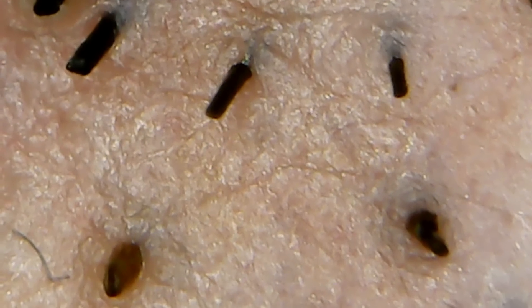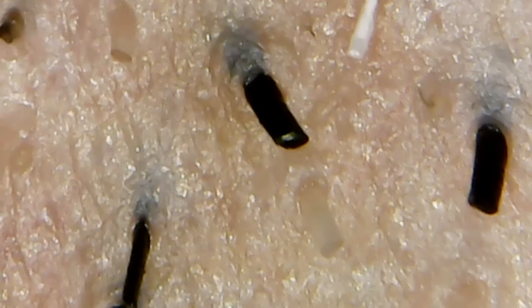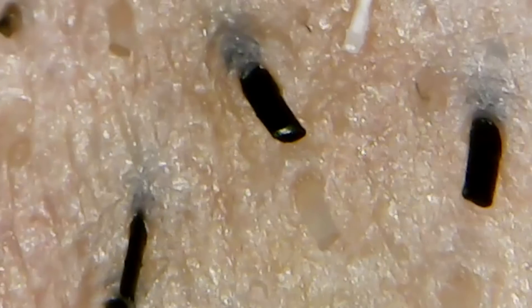The black things that you see, well that is my beard before I had a shave. These little pieces of hair growing out of my skin, and then of course I had a shave and everything looks much smoother right now. When I put the microscope on my forehead I saw some sweat coming out. So I'll be exploring my body today.